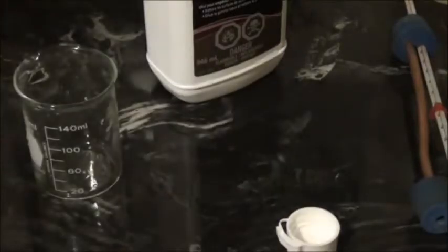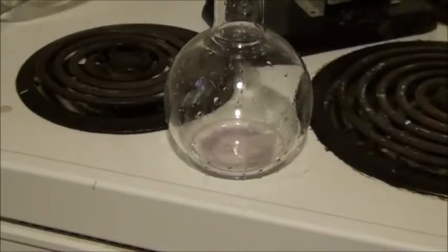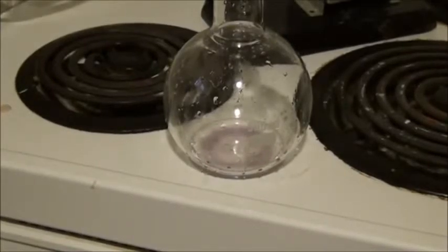Now to synthesize the methyl salicylate. To do this, we're going to need 20 milliliters of methanol, as well as 2 grams of the salicylic acid we just synthesized. To this, add 15 to 20 drops of concentrated sulfuric acid to act as a catalyst. Reflux this solution for about 40 minutes, and once that's done, let the solution cool, and then collect your final product.